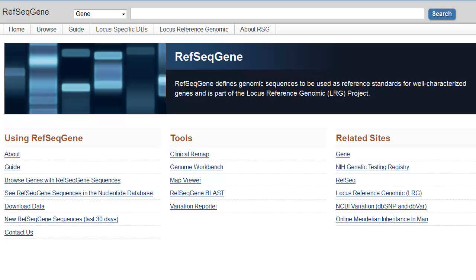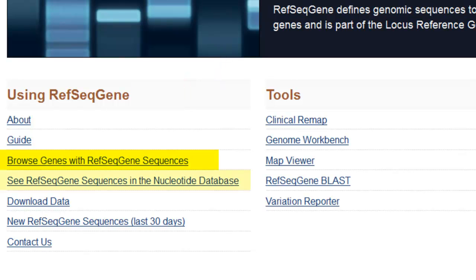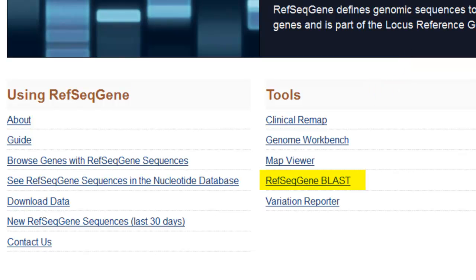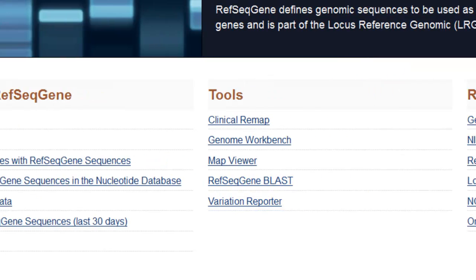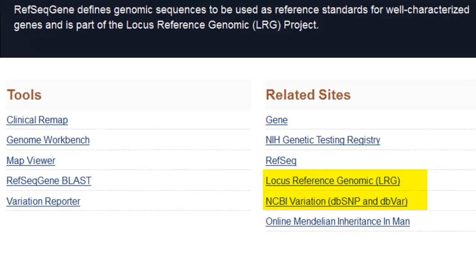I'll start on the RefSeqGene homepage. The links in the leftmost column provide several ways to access RefSeqGene sequences, including a browsable list, the nucleotide database, and FTP downloads. In the center are tools to analyze RefSeqGenes, including BLAST and the Variation Reporter. And in the rightmost column, you'll find links to both NCBI and external databases, including Gene, the NIH Genetic Testing Registry, and Variation Databases.